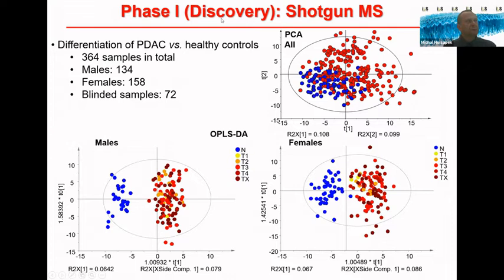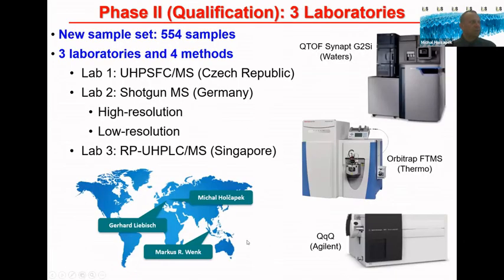Okay, measurement by the second methodology, the shotgun approach. Here, even in the unsupervised principal component analysis graph, you see already a partial separation, which is quite good to make sure that your division in supervised OPLS-DA is not artificial. And here you see quite a perfect match, almost 100% success with quite a big gap in between. So evidently, we have realized the potential of these measurements, and we have patented this methodology and also prepared a paper based on these measurements.